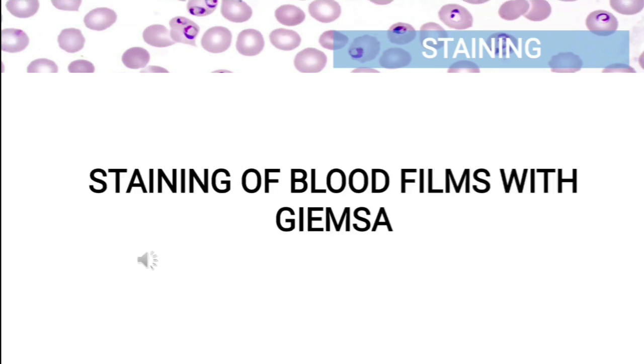Now let us proceed to the staining of blood films with Giemsa stain. Field stain may also be used and will result in an accurate diagnosis. However, because Giemsa is the recommended stain for all blood films submitted for parasite study, the specific morphologic discussion of each Plasmodium species is based on the use of this stain. Both thick and thin blood films should be made and examined.